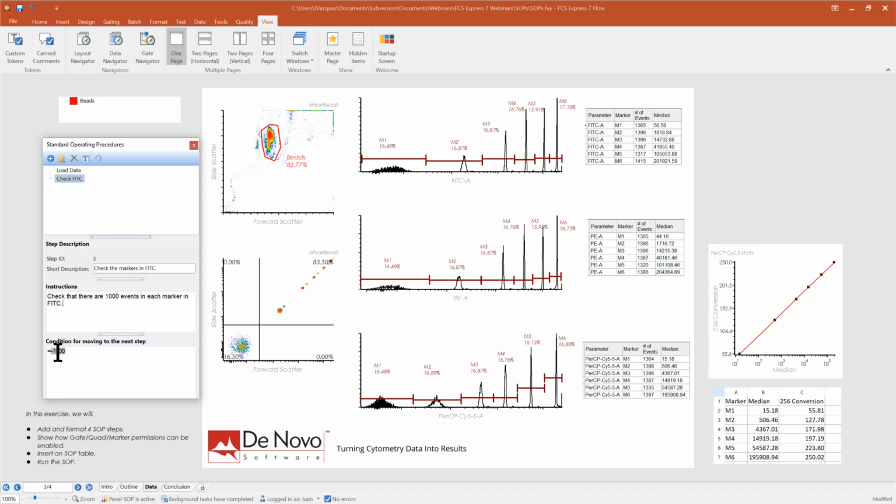What we want to do is make sure that the only way the user is going to go on to the next step is if this particular formula is equal to -1, to make sure that this token is true. If I display that value, you'll see that as I move these peaks around, it will flip and flop between true or false, depending on what the numbers are.